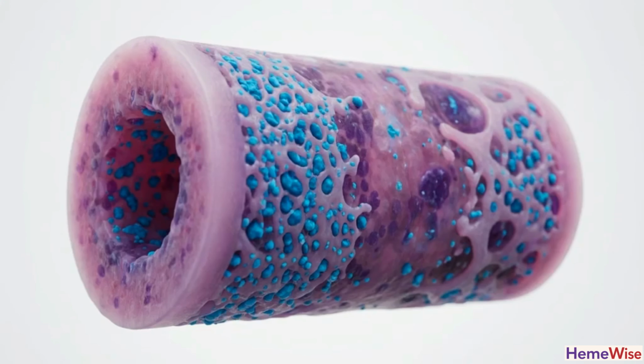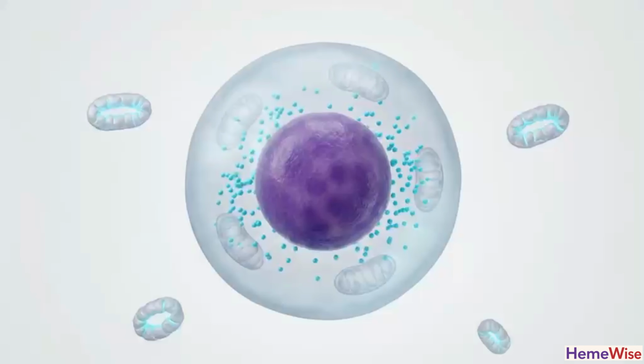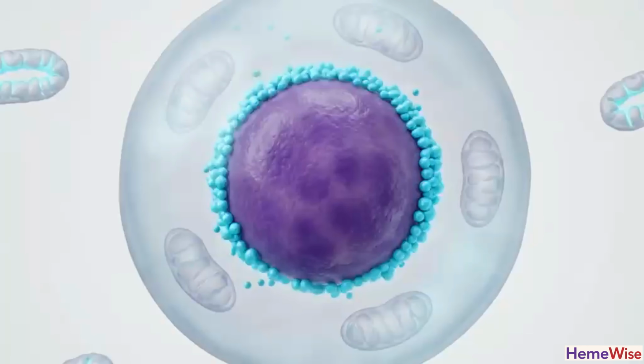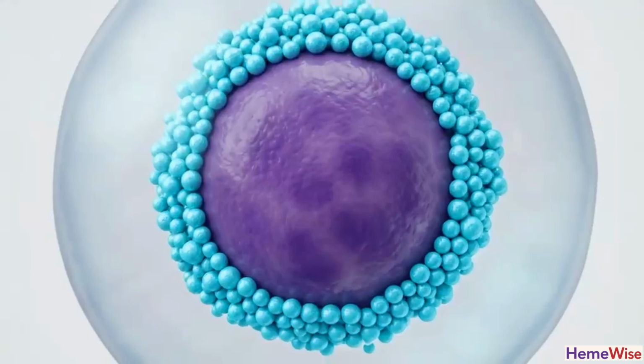To evaluate iron storage, we use Perls' Prussian blue stain. This identifies macrophage storage iron and siderotic granules in developing red cell precursors. This is a ring sideroblast. In these cells, iron accumulates abnormally within the mitochondria, forming a dense ring around at least 1/3 of the nucleus.